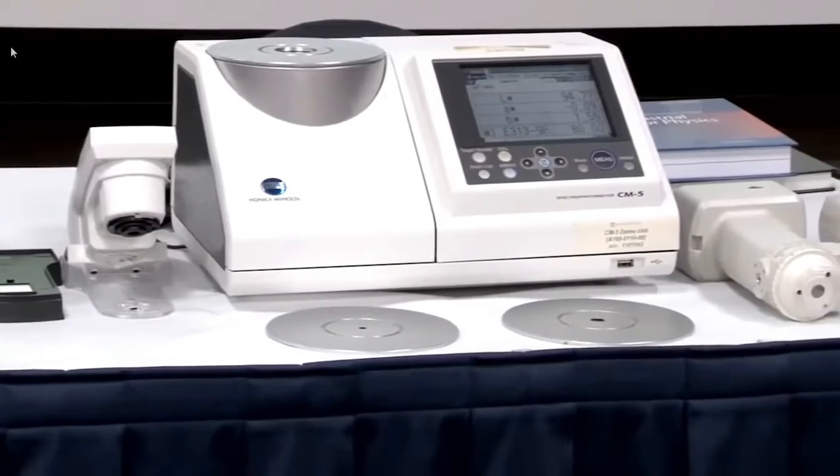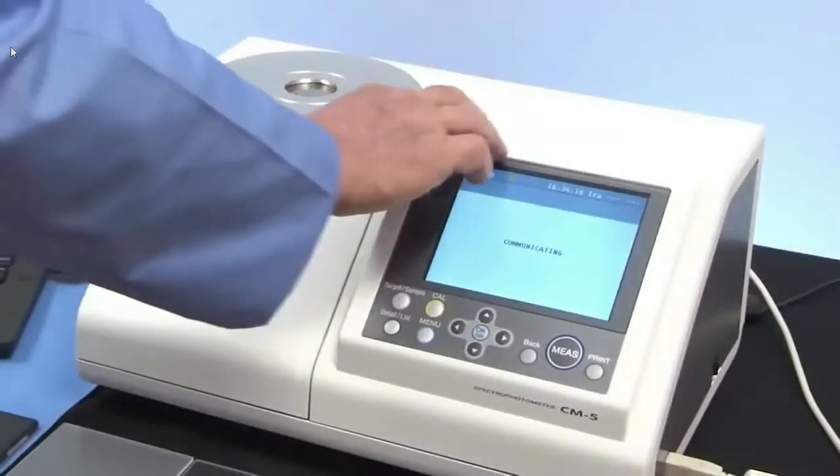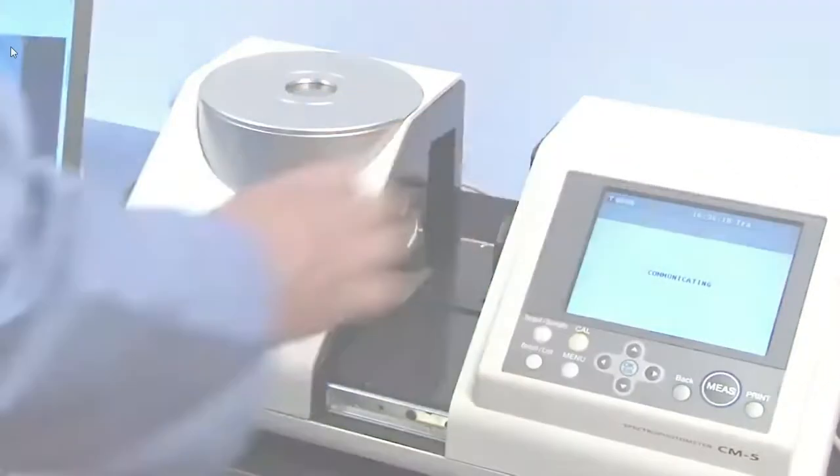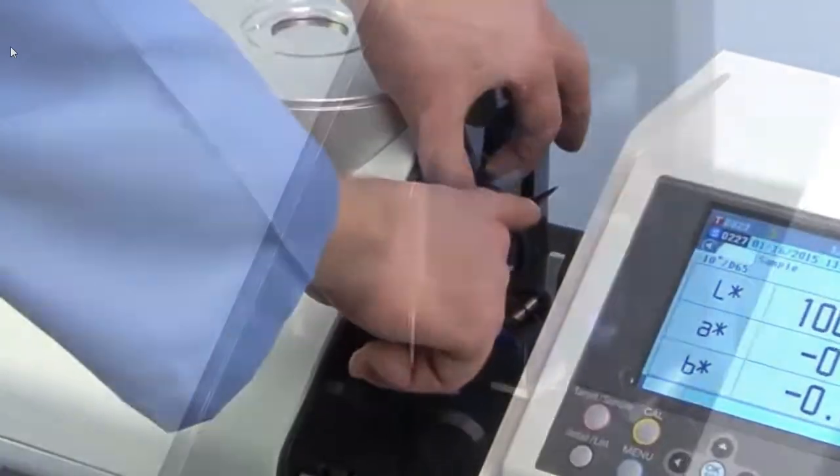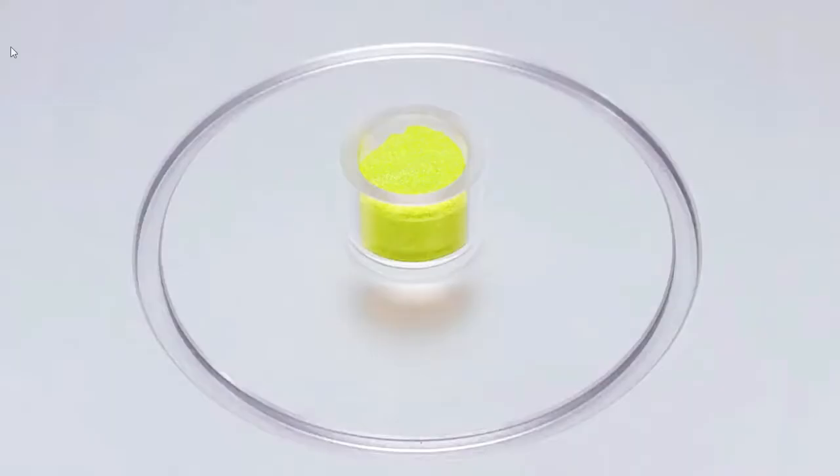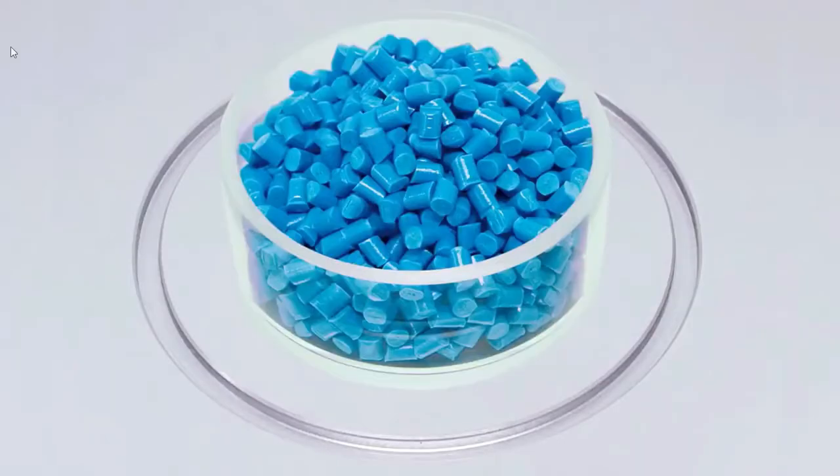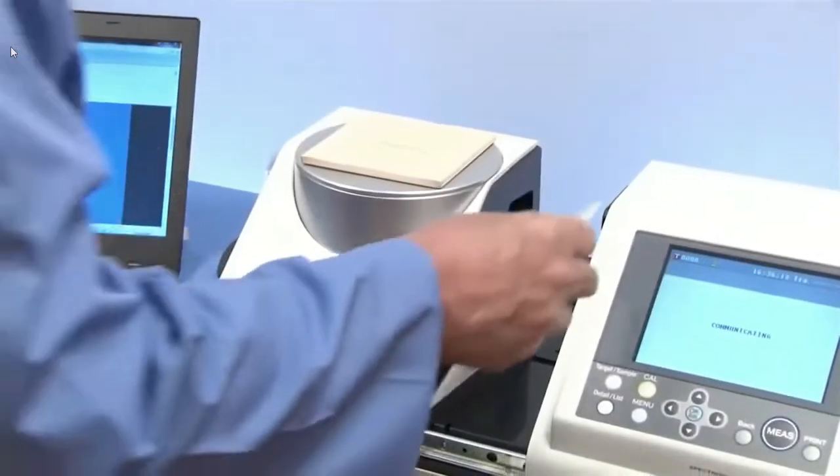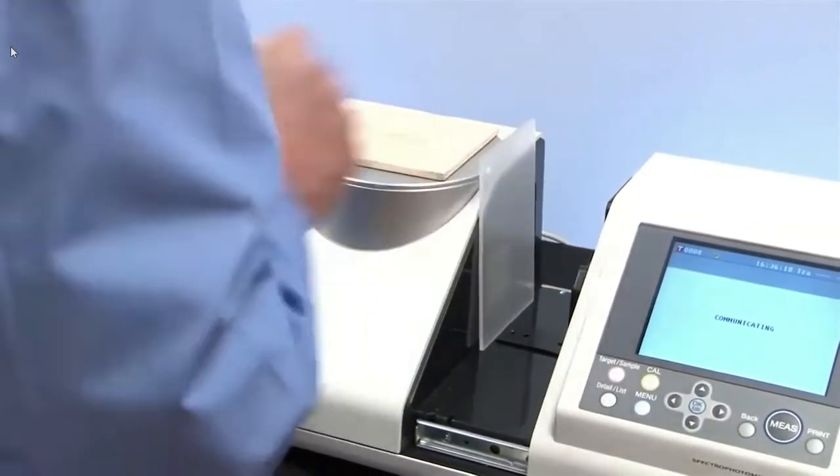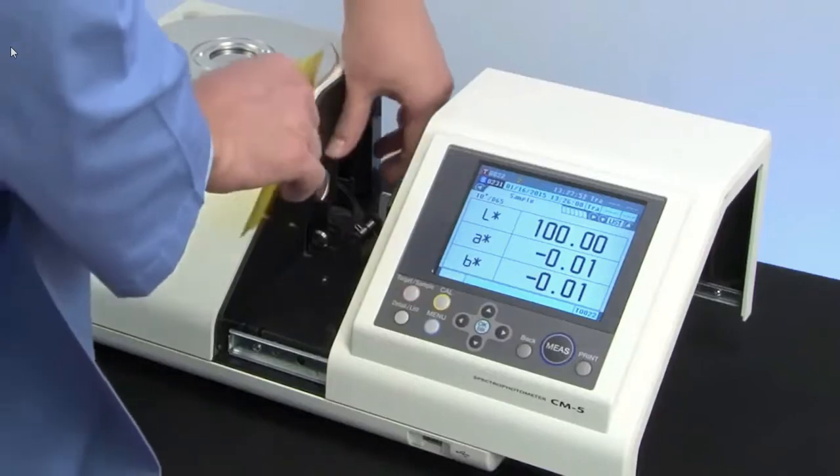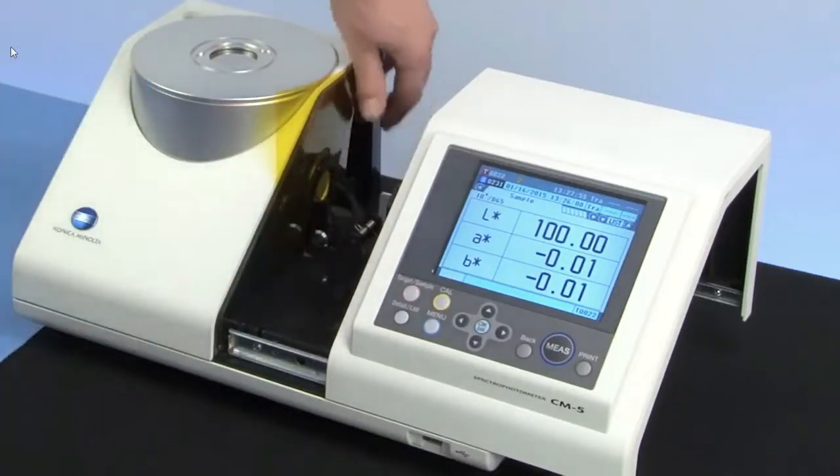The CM5 measures a variety of samples with different material characteristics, such as liquids, powders, paste, and granules, as well as the haze of transparent films and glass. The transmittance chamber can hold large sheets up to 60 millimeters thick.